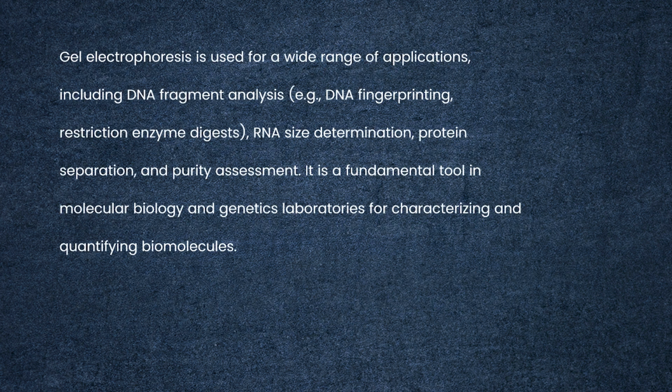Gel electrophoresis in genetic engineering is used for a wide range of applications, including DNA fragment analysis like DNA fingerprinting, restriction enzyme digestion, RNA size determination, and protein separation to assess the purity of the protein. It is a fundamental tool in molecular biology and genetics laboratories for characterizing and quantifying biomolecules.